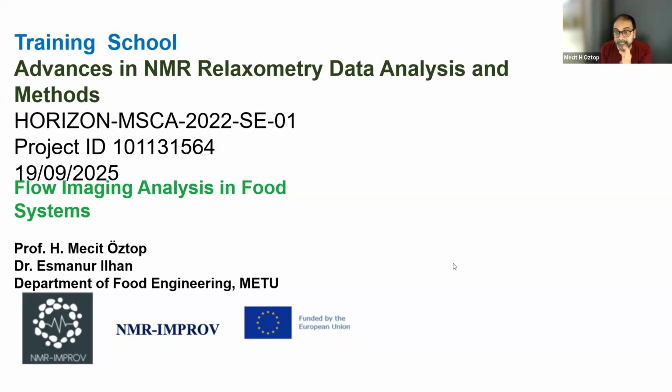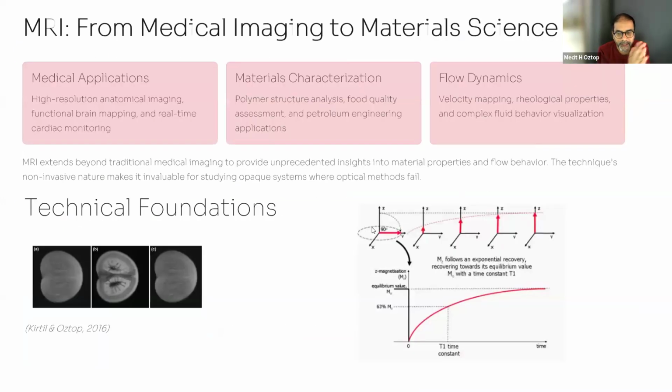By the way, we also had some experiences testing this product with different milk samples. We looked at the rheological properties of different plant-based milks and compared them with regular whole milk. We can also test it with different types of emulsions, and I'm going to talk about that in a minute.